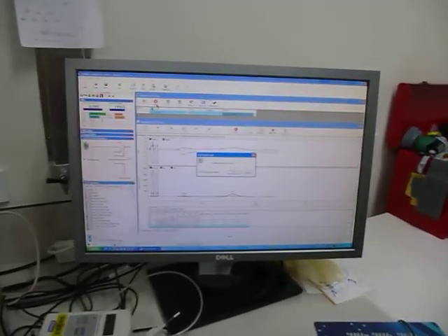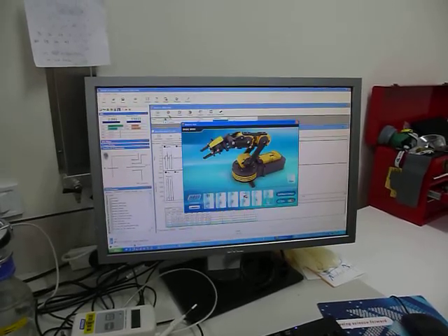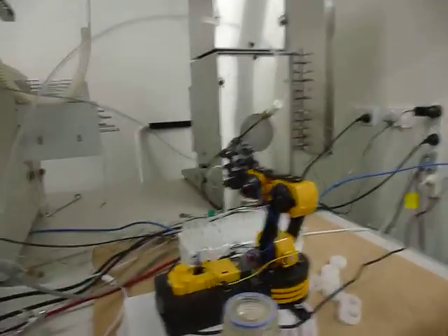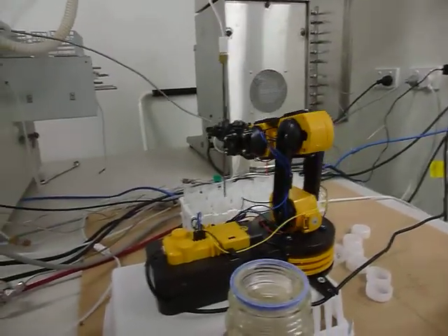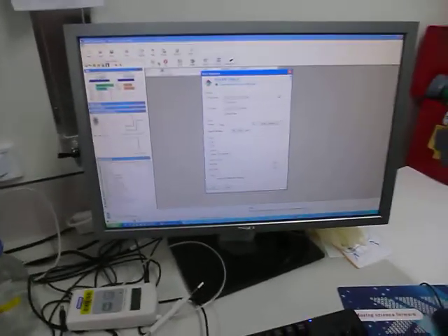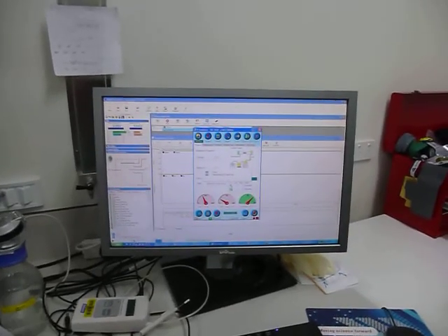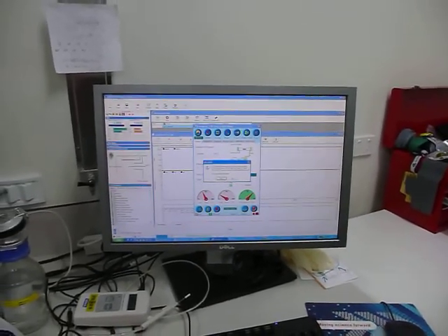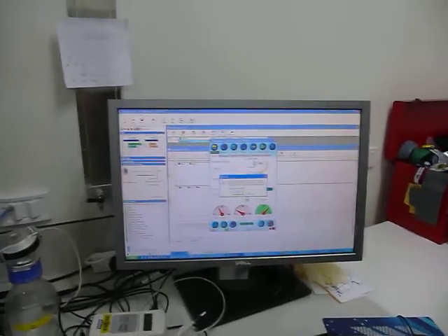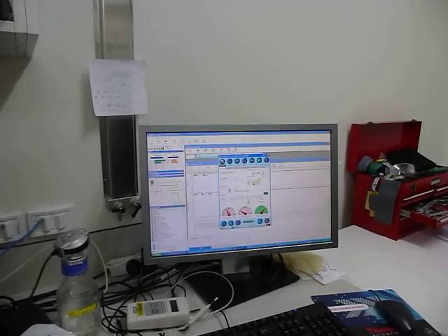So now it finished the measurement. This is automatic. I told the script to finish the measurement, and then it will start the robot now. So the robot goes to the second vial there and moves inside the second vial. Then it starts sample number 2, the IRMS software, and then the Aurora software, the TOC analyzer software, also starts. It gives some messages, and the script will answer them as if it was a user, and then it will start.